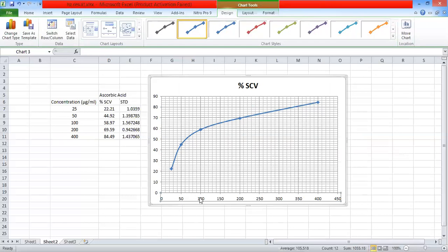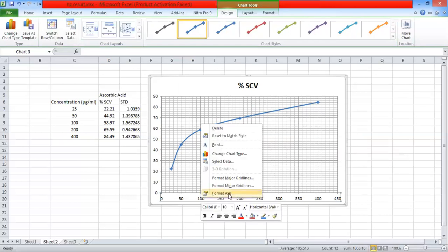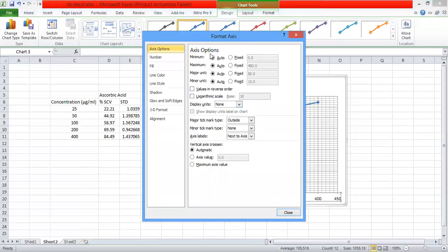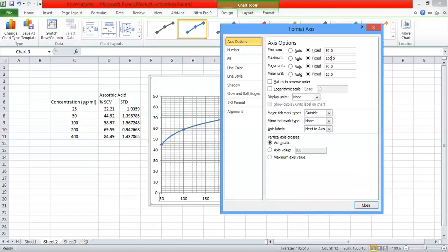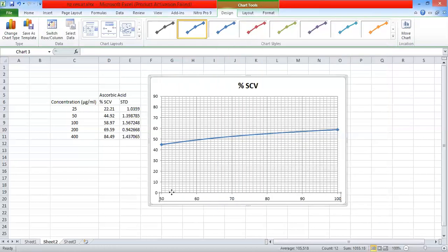To do this, we have to right-click. First select this option, then right-click and select Format Axis. You can see the axis options — everything is currently set to auto, but I am going to fix them. The minimum, meaning the starting point, I am going to set to 50. The maximum I am going to set to 100. The major unit I am going to set to 10, and the minor unit to 1. After choosing this, I'll close and you can see that Excel has automatically modified the graph.